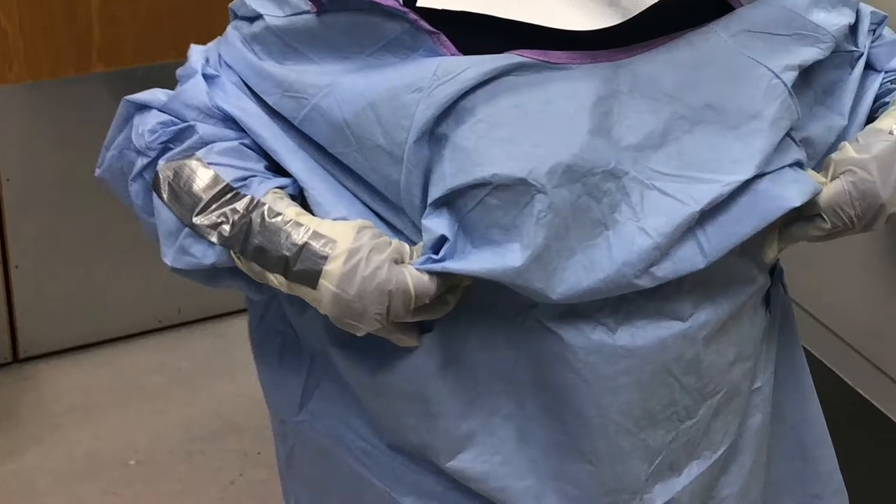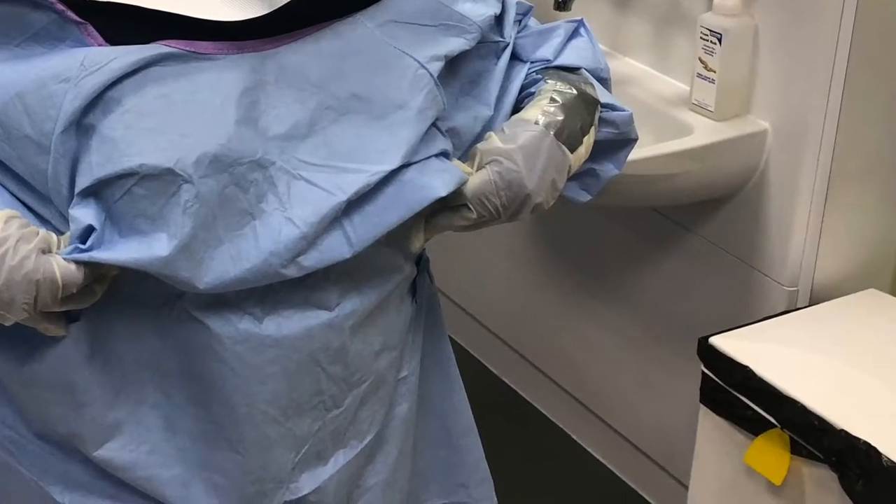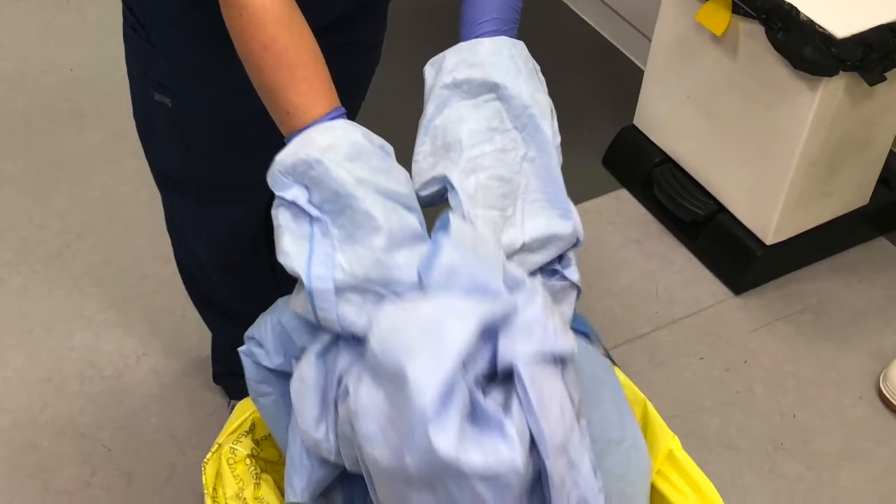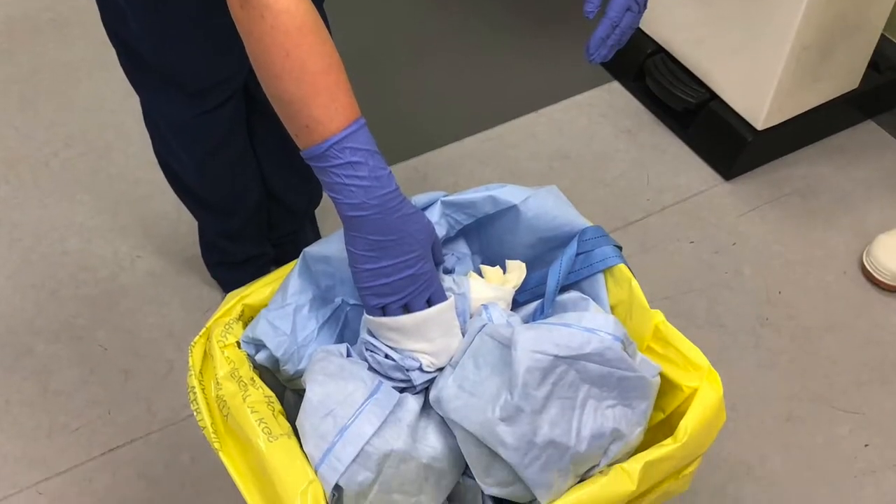Have your colleague give a visual inspection of your gown for damage. Untie the gown, and pulling down and away, rolling it inside out, place the gown into a bio-waste bin.